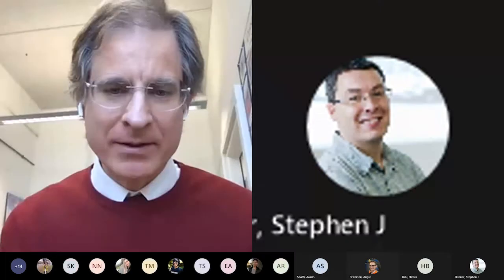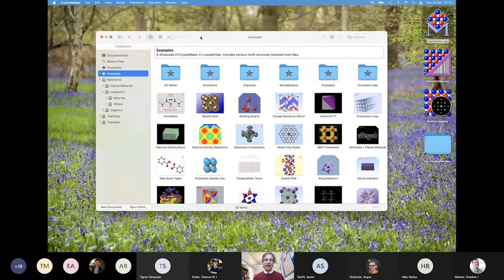Well, let's go back and have a look at CrystalMaker then. And actually, I'm going to share the entire screen, so we can do screen number one. It looks like it. Good, okay. So I've launched CrystalMaker, and the first thing that happens when you launch CrystalMaker is you see a little window, which is our library window. This is something that you don't have to show. You can set a preference not to show it if you don't want to, but it does allow you access to a library of structures, and it provides a way in which you can organize your own structures.